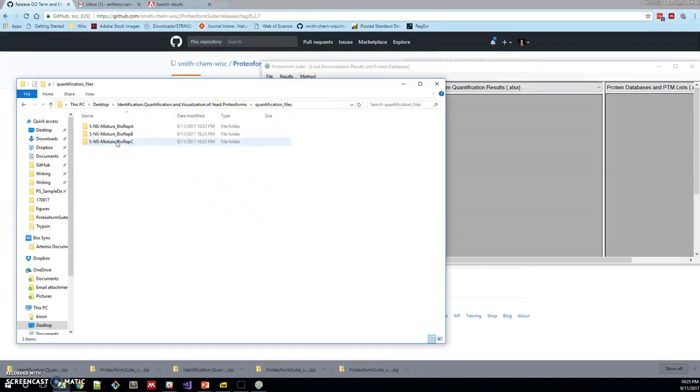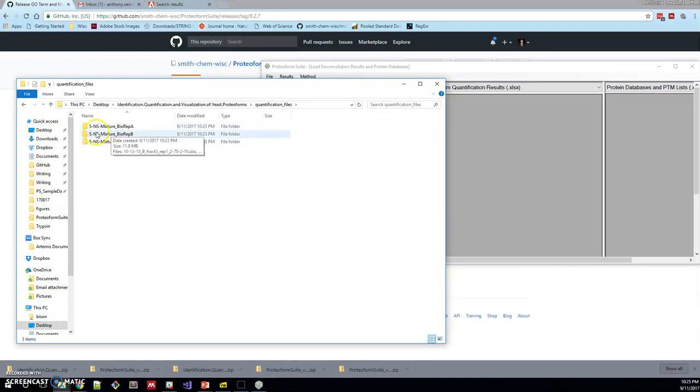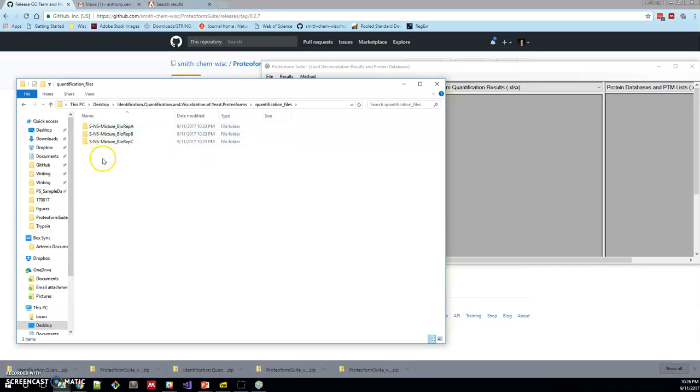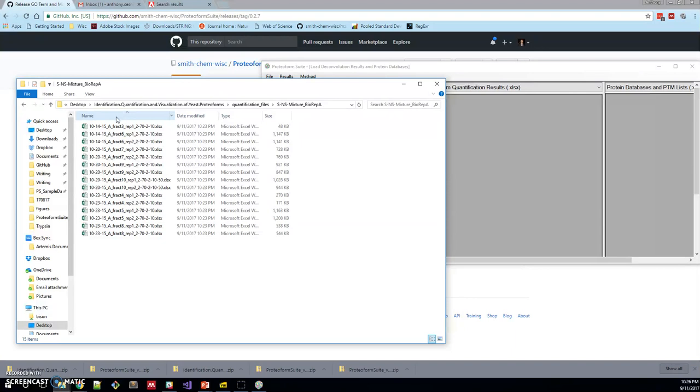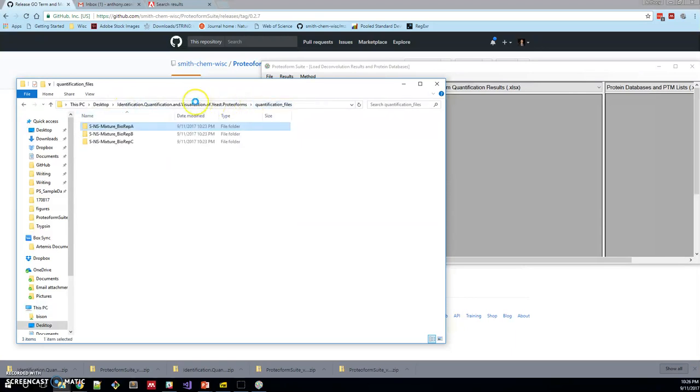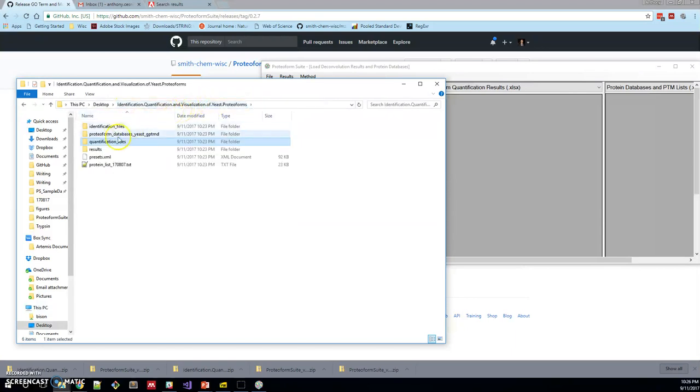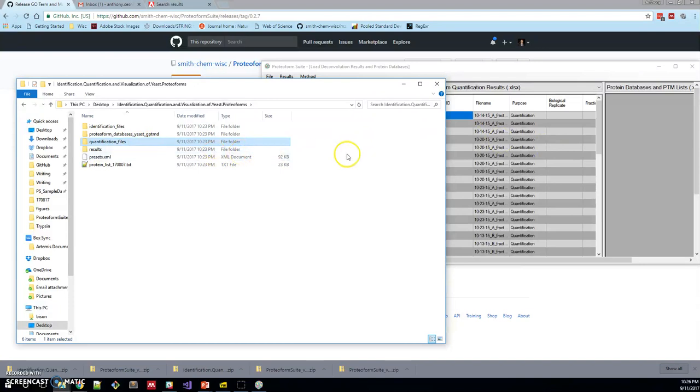Next, we have quantification files. We did three biological replicates of a one-to-one mixture of normal and stressed yeast. In each of these folders, you can see that we split those biological replicates into fractions. We used gel-free to fractionate them and then we injected those into the mass spectrometer twice each. Let's drop that into the quantification files and you can see that populated that.